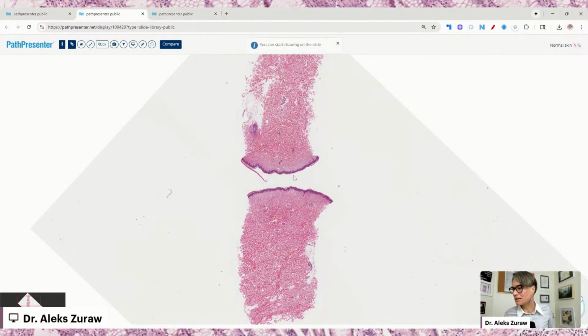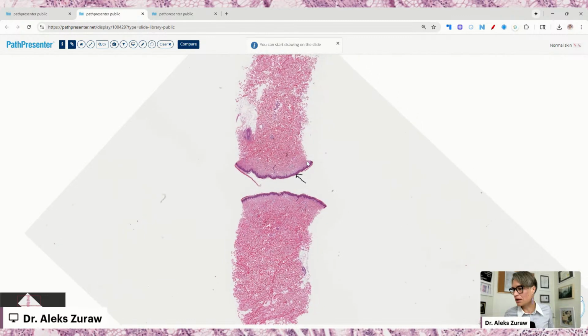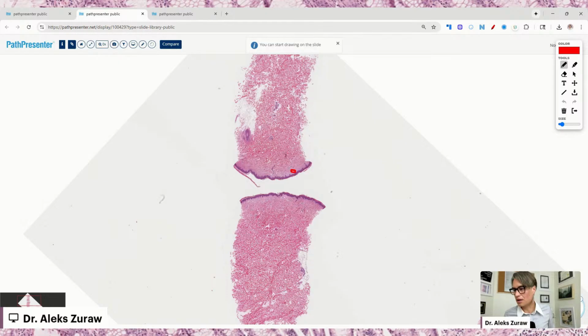And you can already see that this here is a lot darker. This is a certain shade of pink here, and a different type of pink, and a lot looser here, right? So we have these 3 different layers, that's what they're called officially. And again, this is the outside going to the inside of the body.